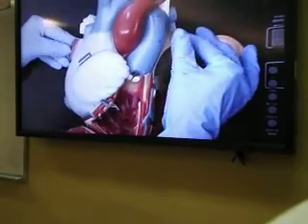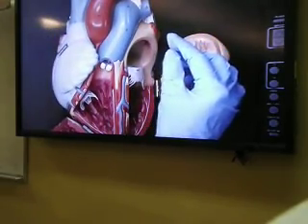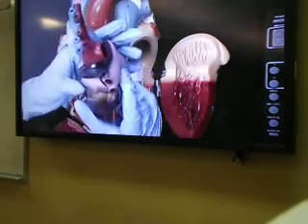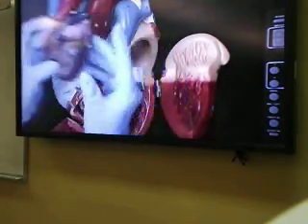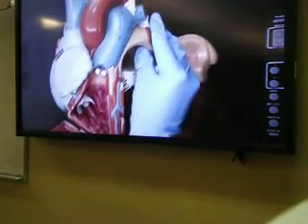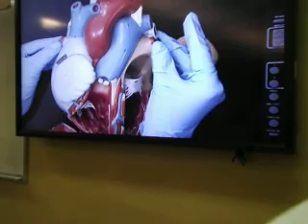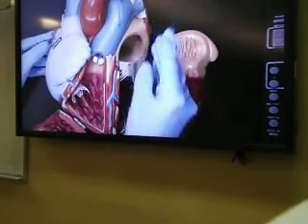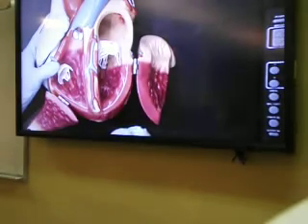So this is why, again, you see the pulmonary veins colored in light red, and in these ones also they are colored in red, for you to understand that. Okay. So the 4 pulmonary veins, which are bringing oxygenated blood, will bring the oxygenated blood to the left atrium.